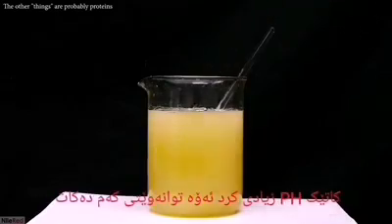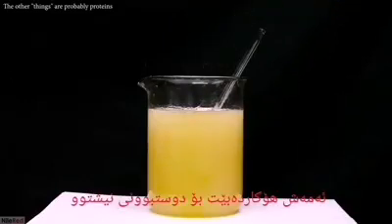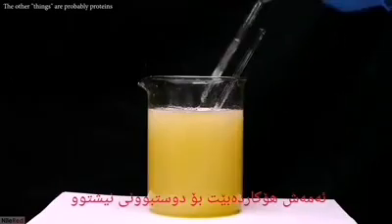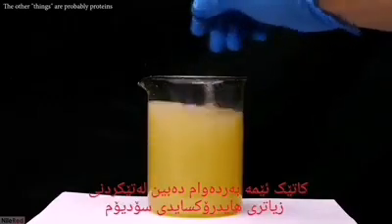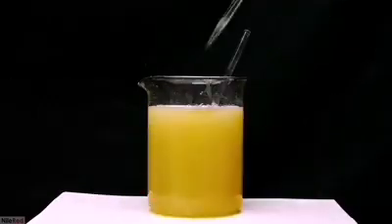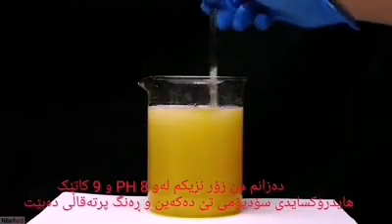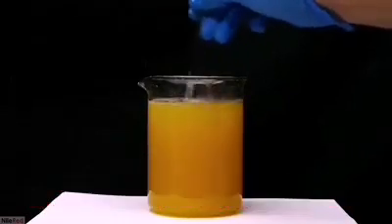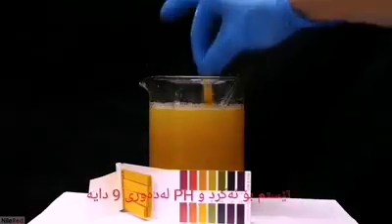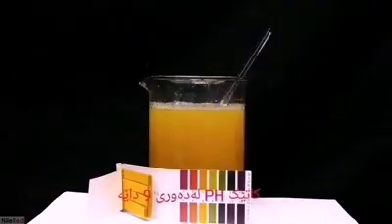As the pH increases, the solubility of other things will decrease, causing a lot of them to precipitate out. As we continue to add sodium hydroxide, more and more solid will form. I know I'm very close to a pH of about 8 or 9 when the addition of sodium hydroxide generates an orange color. I test the pH and see that it's around 9, and if it's a little bit higher than 9, it's probably still okay.